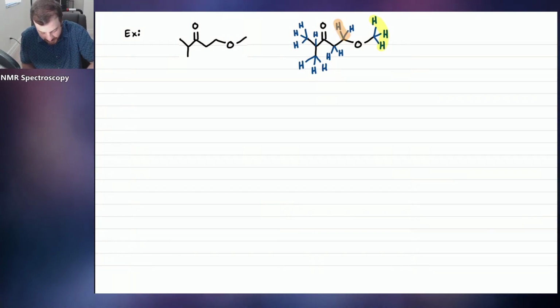These 2 hydrogens here, they're enantiotopic, so they're going to give a single signal in the proton NMR, but they are unique for themselves. And then in another chemical environment, we've got these 2 hydrogens. Those are clearly unique hydrogens. They are in a distinct chemical environment. We've got this hydrogen right here, which is in a unique environment. And then what about these hydrogens here? Obviously, the methyl group hydrogens are always homotopic, right?